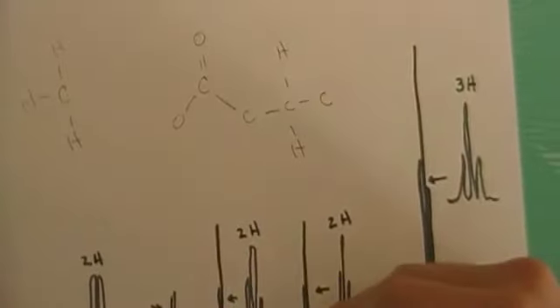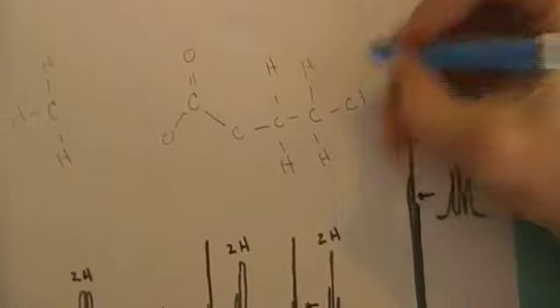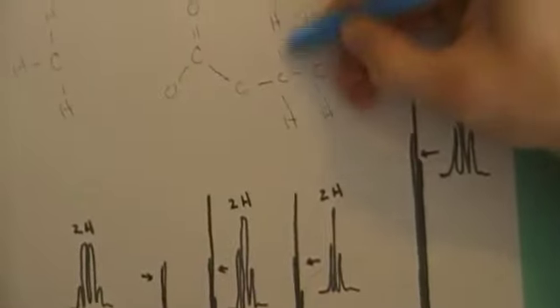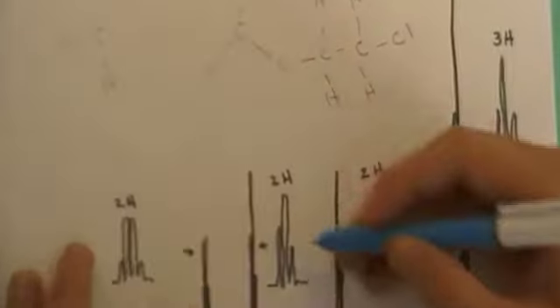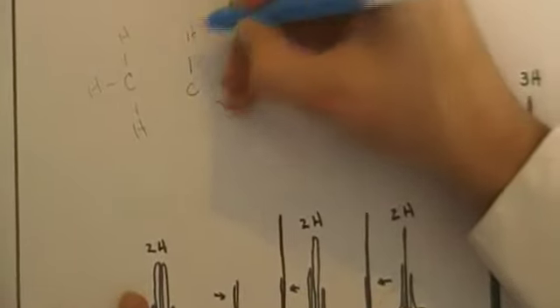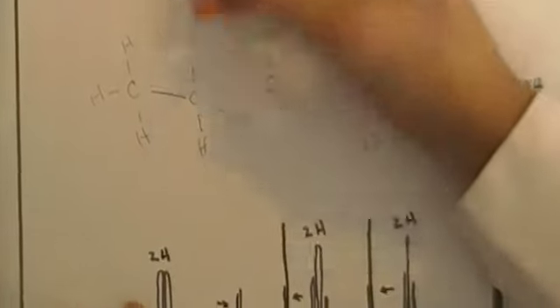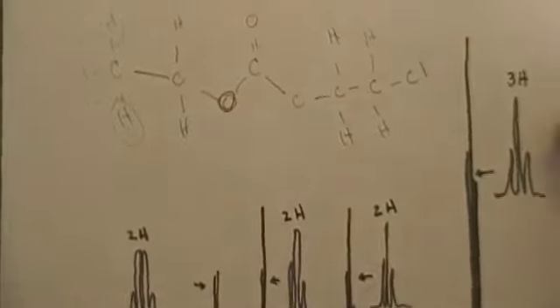This peak is going to be attached to an electronegative atom, and that's going to be the chlorine atom. So we're going to draw the H2 here with the chlorine, which gives us these 2 neighbors, as we can tell. Now right here, this quartet peak, that's going to be a carbon attached to this oxygen, and then we have a hydrogen, and then a carbon. So we get the quartet here with these neighboring hydrogens here. And because it's more downfield, it's attached to this oxygen, which does that for it. Thank you, Professor DeMattean.